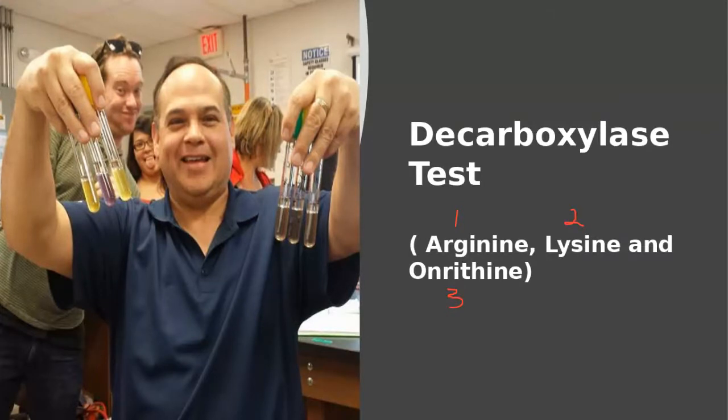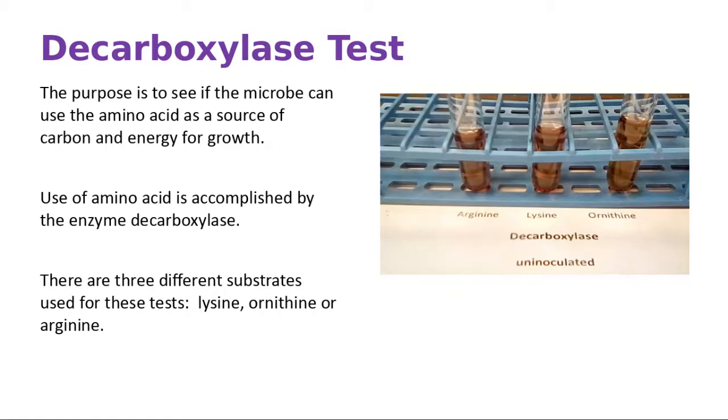Each one of them has its own separate tube, okay? And we're looking for the ability of a microorganism to decarboxylate, to break apart the molecule. And if they do that, they're going to release this thing into the environment. And what is this thing? What do you think? Brenda, what is that thing?